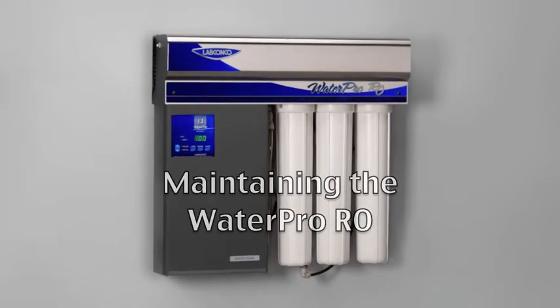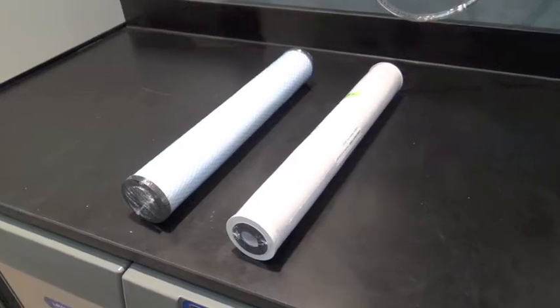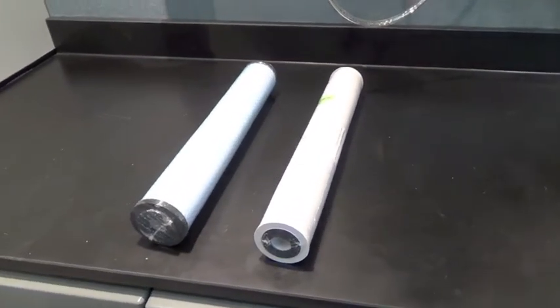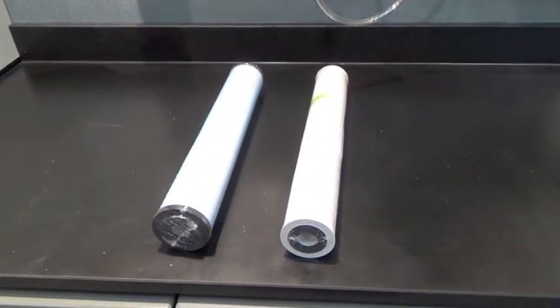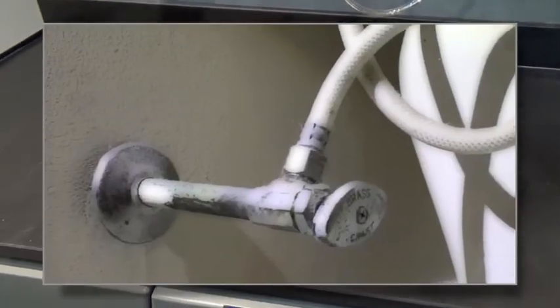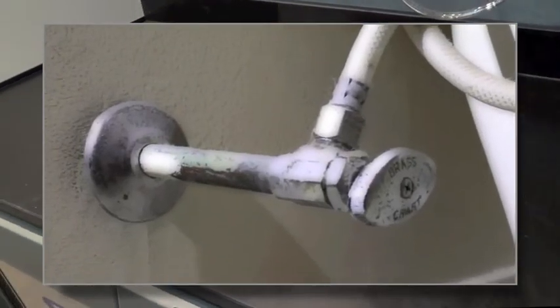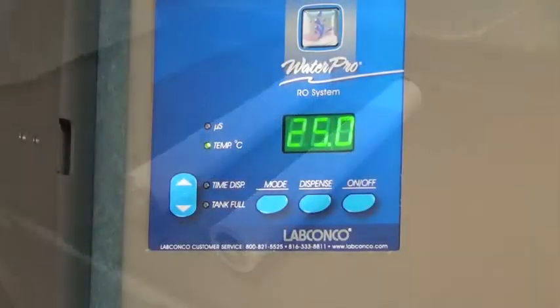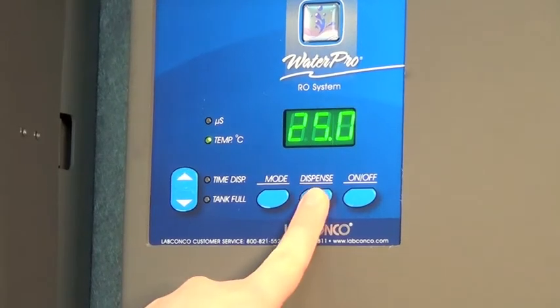The WaterPro RO system requires little maintenance. Change the pre-filter and carbon pre-filter once every two months. To replace these filters, begin by closing the tap water supply valve and press dispense for one minute to relieve system water pressure.